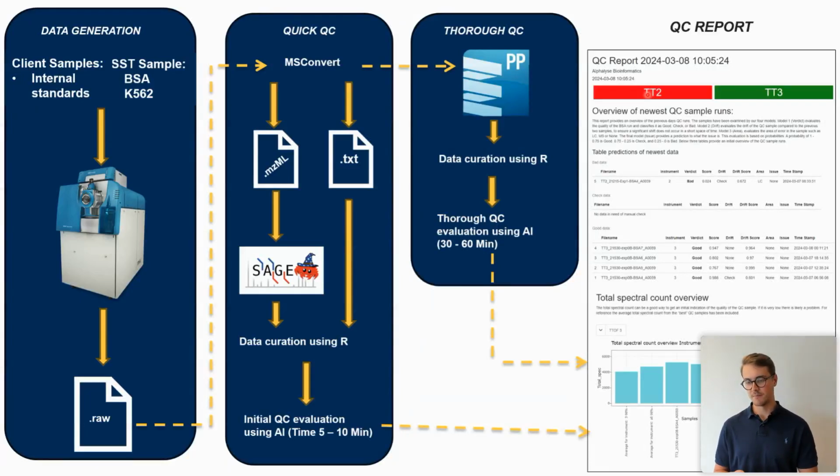So it has a lot of different figures and plots to demonstrate the different elements of this analysis. And it also has an overall score indicating the level of quality of that specific sample. So then you have a very clear indication of how your sample has performed.